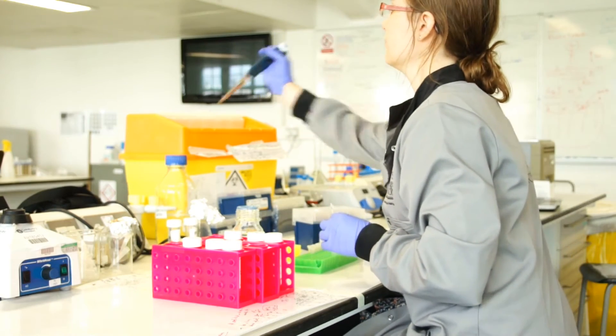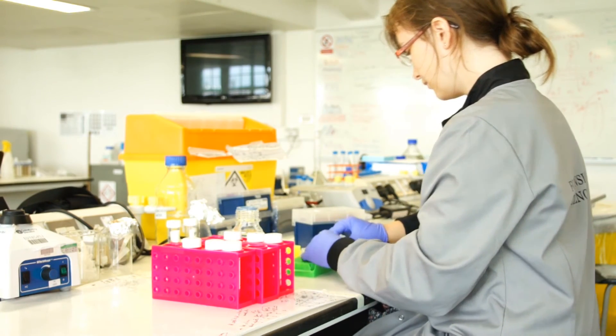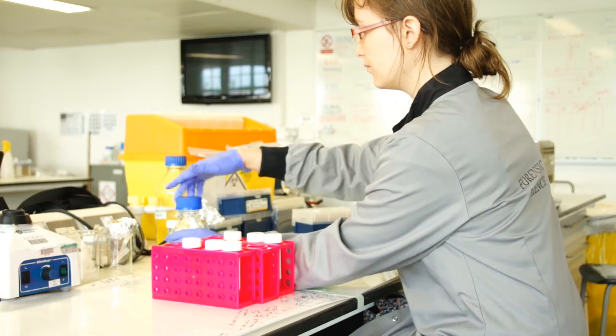I'm looking at a new detection method for body fluids on surfaces. In the areas where there's body fluid, it will turn on the fluorescence. This technique could be used to detect multiple body fluids — for example, semen, saliva, and blood — all at the same time.